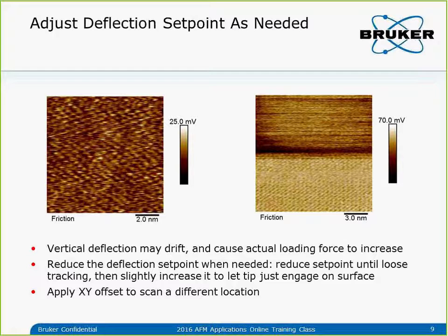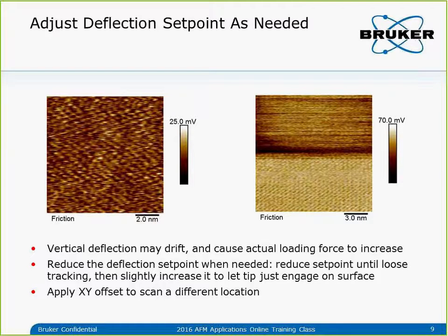Once I confirm the tip is on the surface, I start to decrease the setpoint slowly until the tip starts to retract from the surface — meaning the setpoint is below free air deflection. Once I see the Z-piezo withdraw from the surface, I increase the deflection setpoint slightly — like 0.1 to 0.2 volts — to make sure the loading force on the tip is very small. The tip is just landed on the sample with minimal force. This is how we control the force.